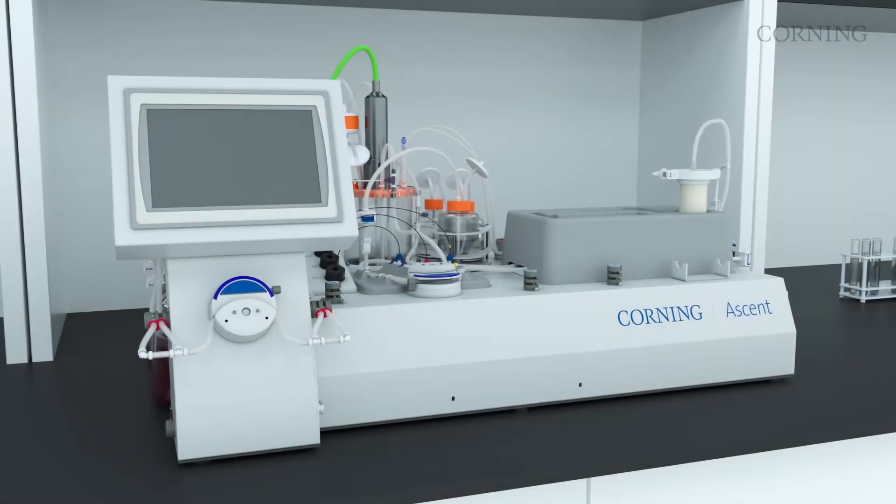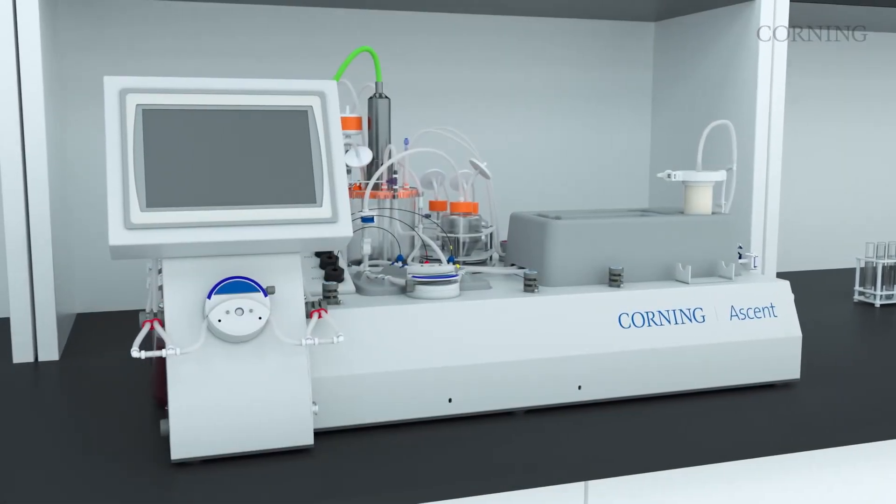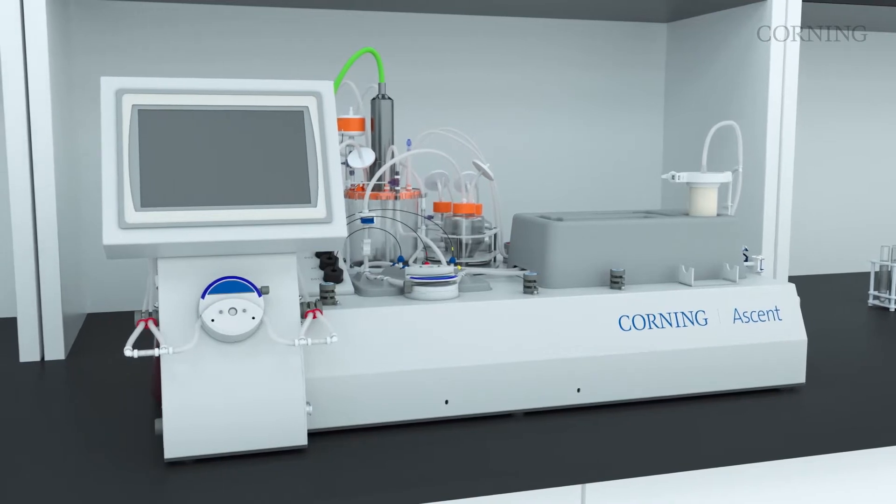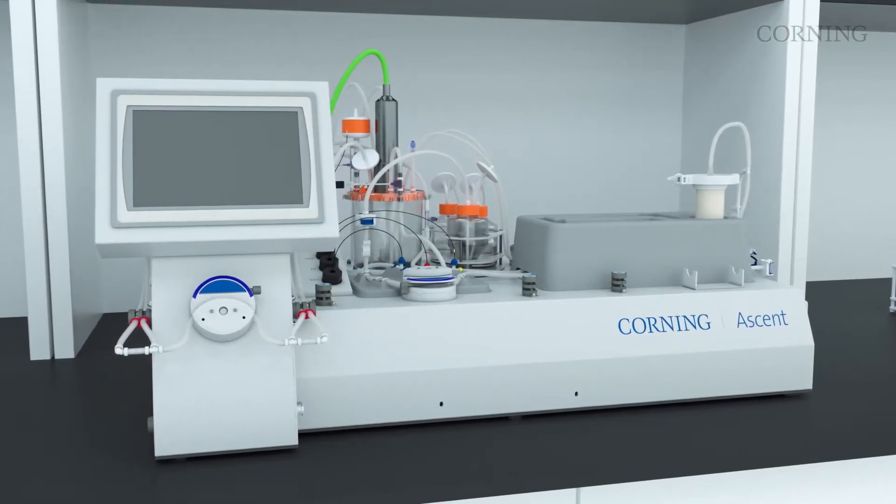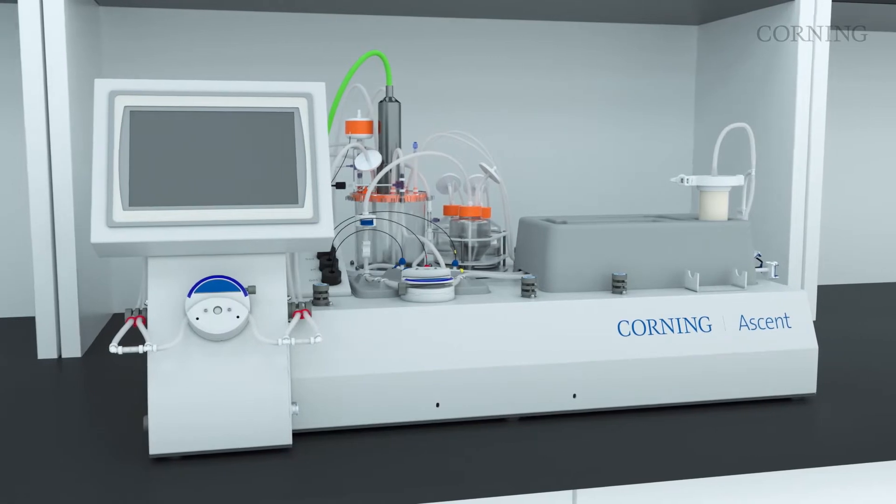The Ascent FBR system is an automated closed system bioproduction platform with inline monitoring and lot traceability for CGMP production needs.